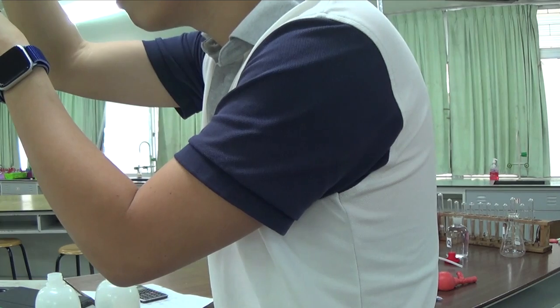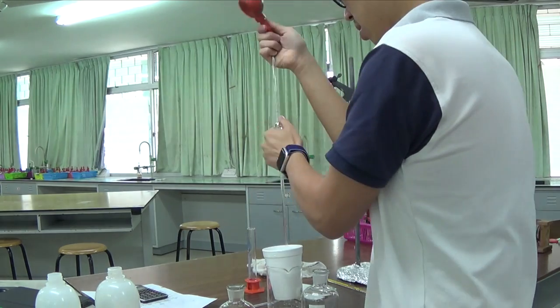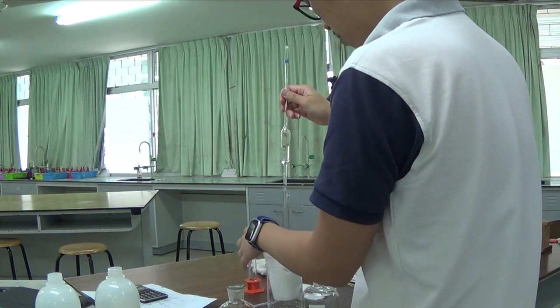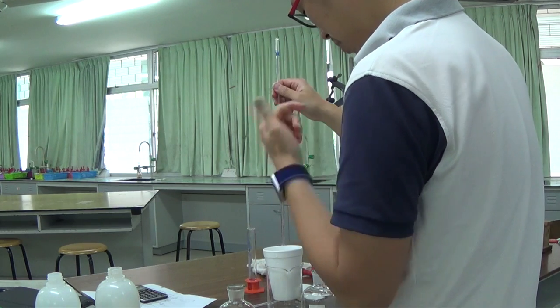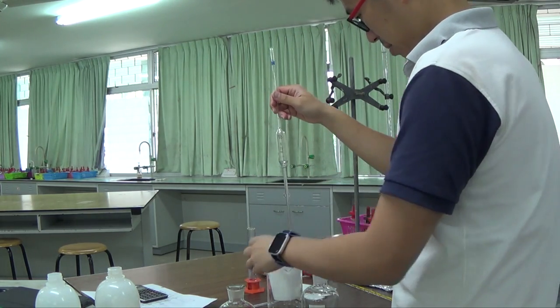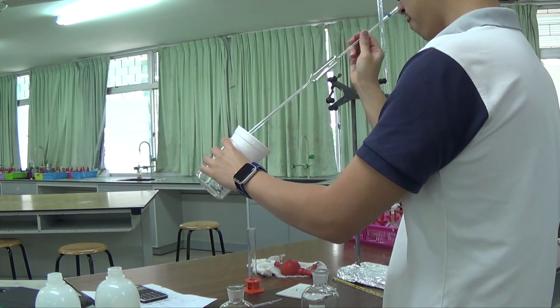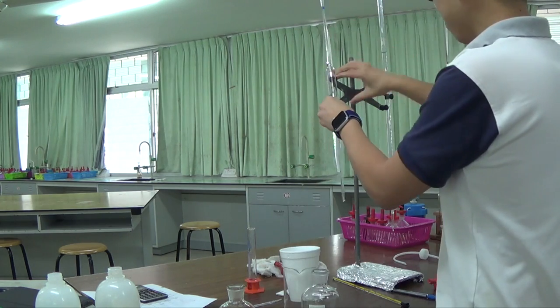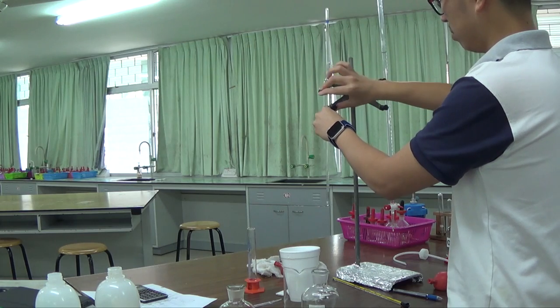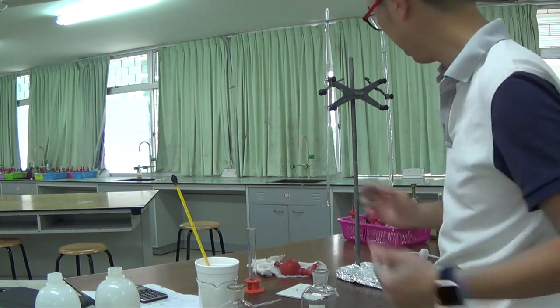So I'm going to inject whatever I overshot. So there's 25.0 straight into the polystyrene cup. Styrofoam cup. Let gravity do its job. I really shouldn't be shaking it up and down. So, nearly done that. 1, 2, 3, 4, 5, 6. Okay, so I'll put my pipette back for safety reasons. Insert my thermometer in there, and I'll record the initial temperature in a little bit.